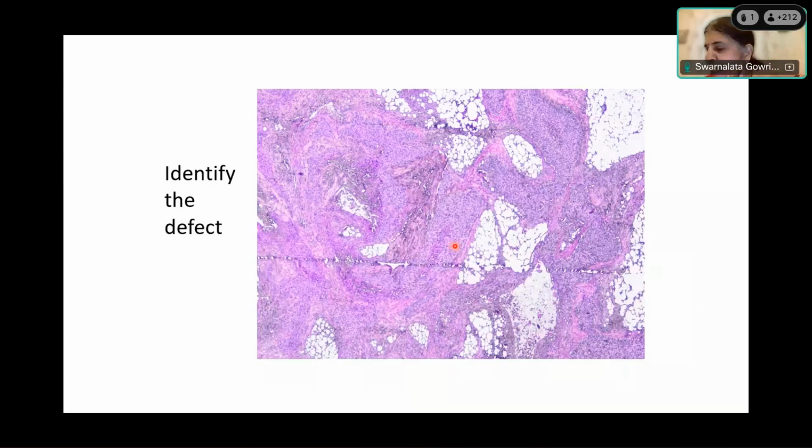Here, what is a defect? Okay, let's go to the last person, Arpita. Arpita, is she here? Yes, ma'am. Arpita, welcome. So what do you think is the defect here? Ma'am, there's a horizontal line running across. Oh, that's right. Very good. There's a nick over here. There's a nick in the knife. I'm glad you were able to see it.